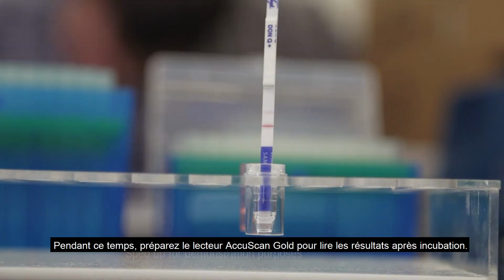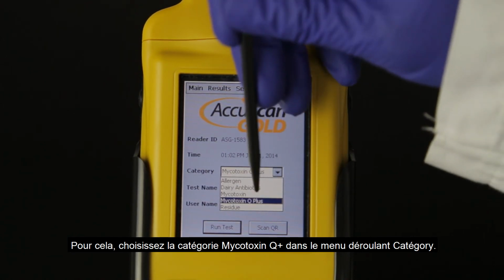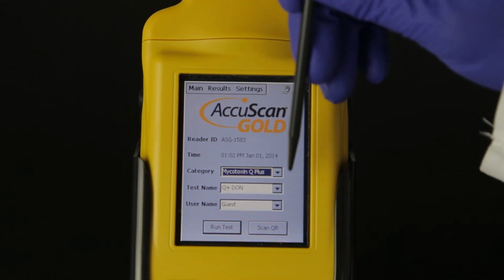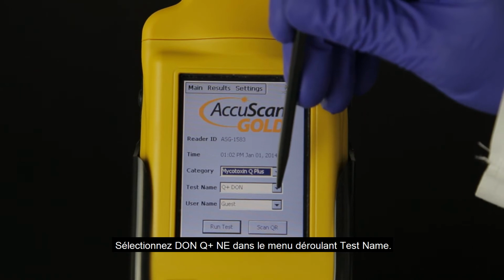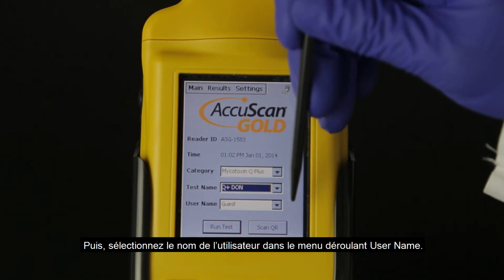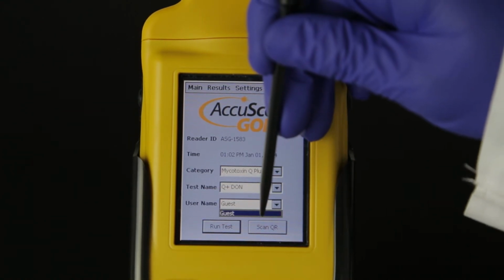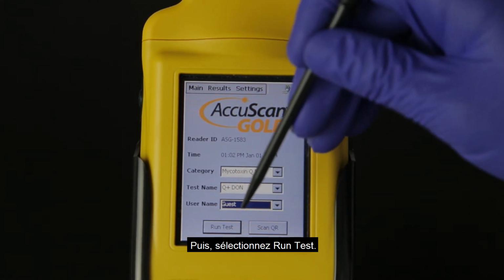During this time, prepare the AccuScan GOLD reader to read your results when the incubation is complete. To do this, select the test category, Mycotoxin Q+, using the category drop-down menu. Select the Don Q+ test type using the test name drop-down menu. Next, select the appropriate username under the username drop-down menu. Select Run Test once the test information is selected.